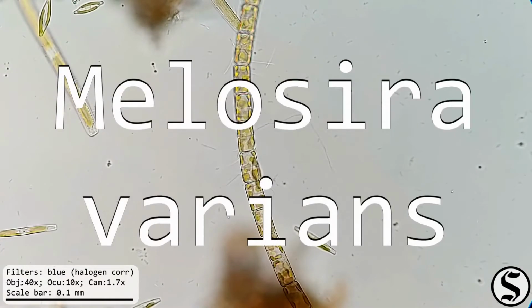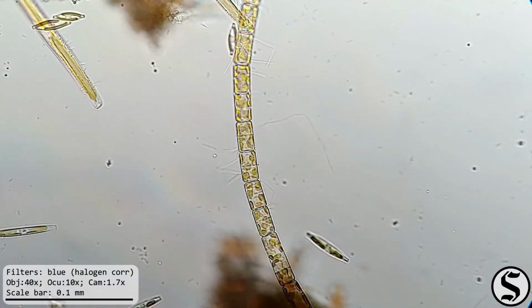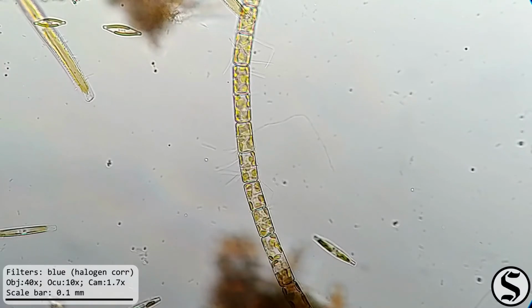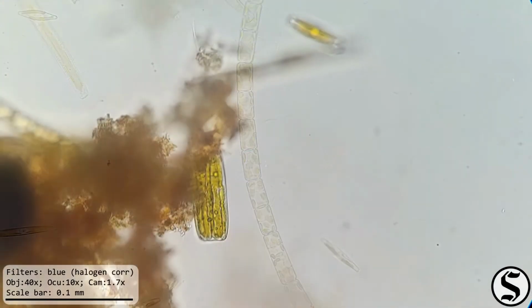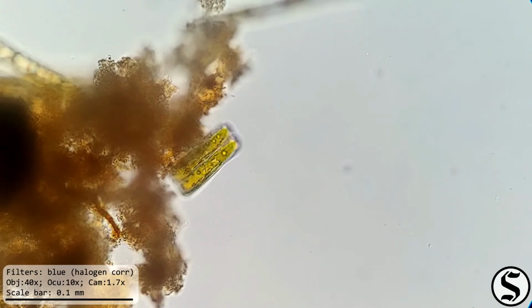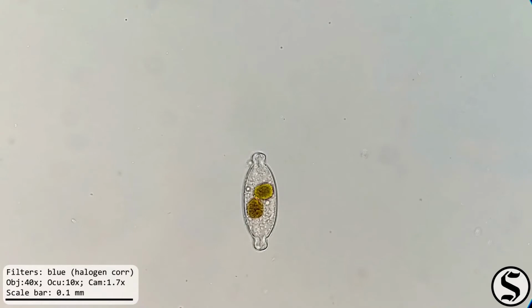This here is Melosira varians. That was a type of diatom that we saw last time. Its name comes from the Greek melo for melon and seira for chain, and varians comes from the Latin varius for various or varied. Here's another diatom of the order Naviculales. I think it's really interesting just how many different shapes and sizes of these diatoms there are. They're really a diverse class of organisms.